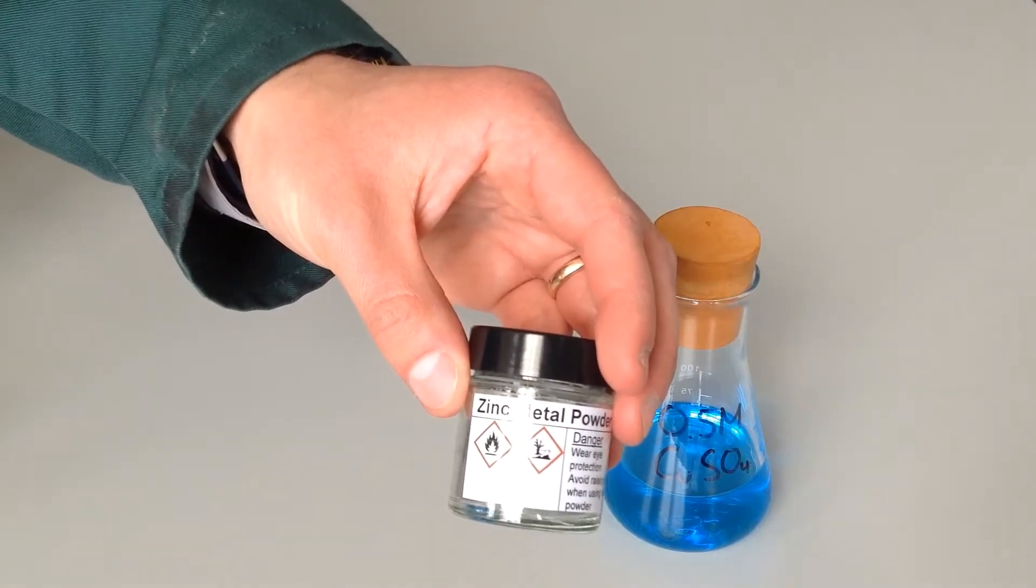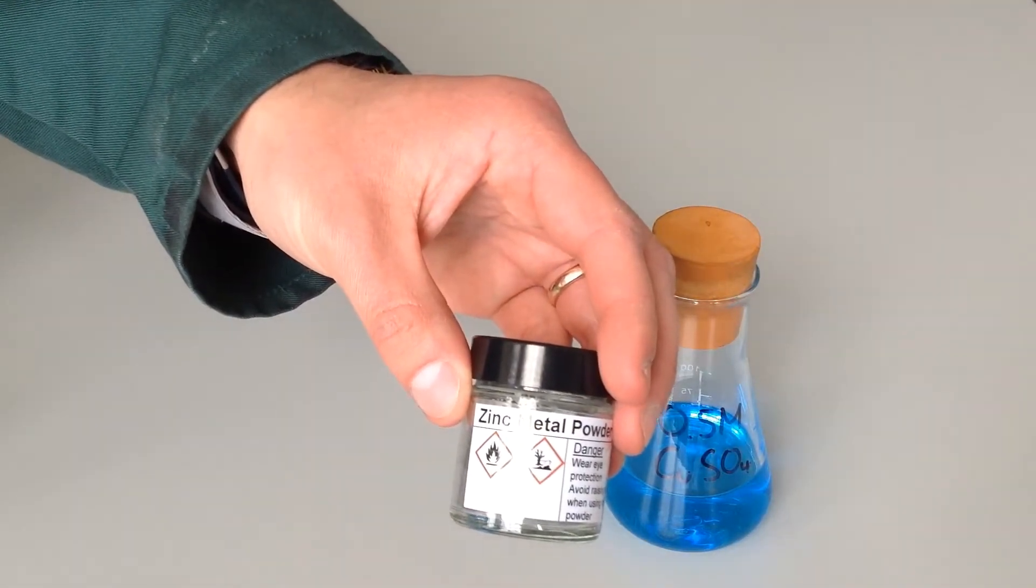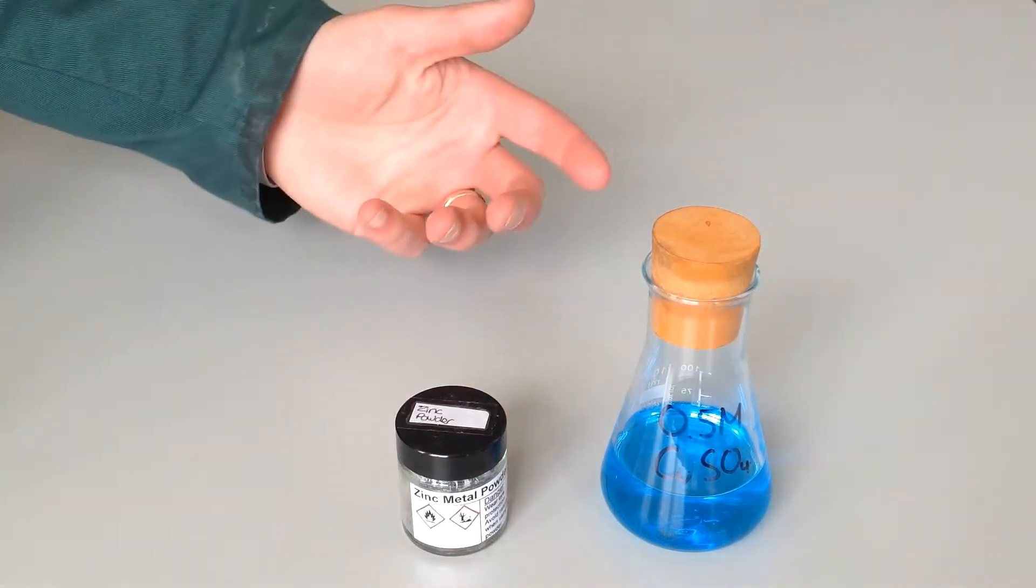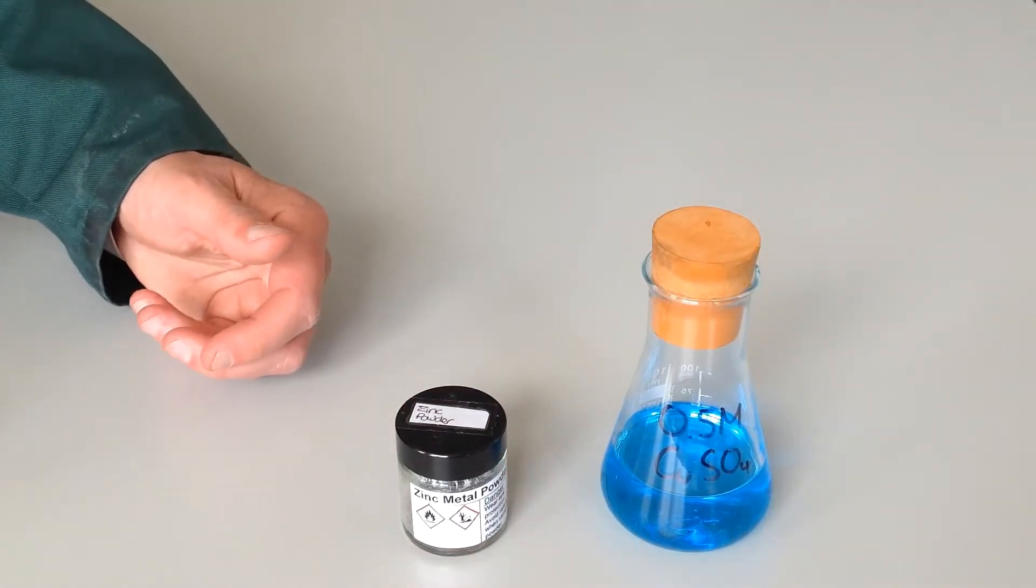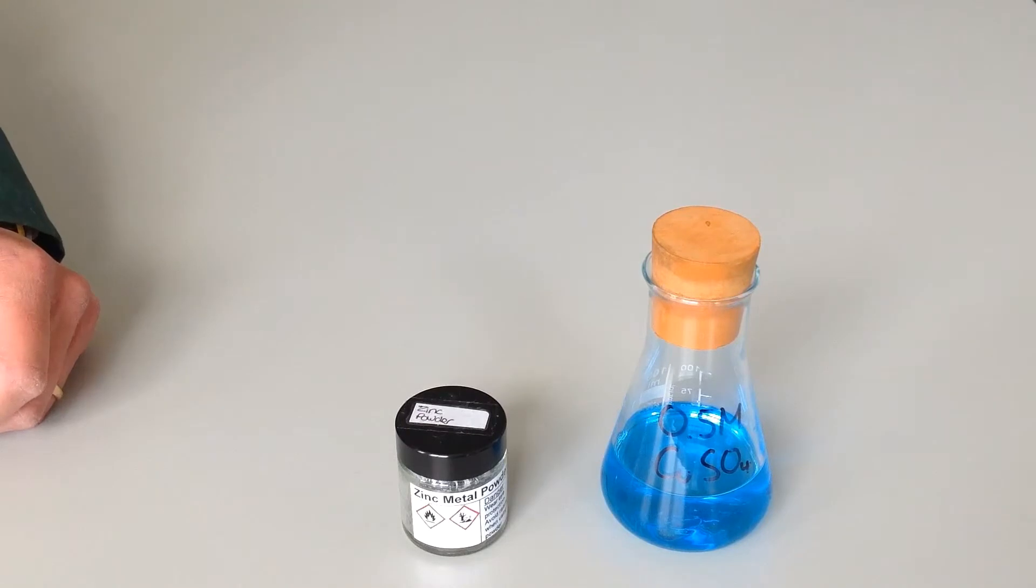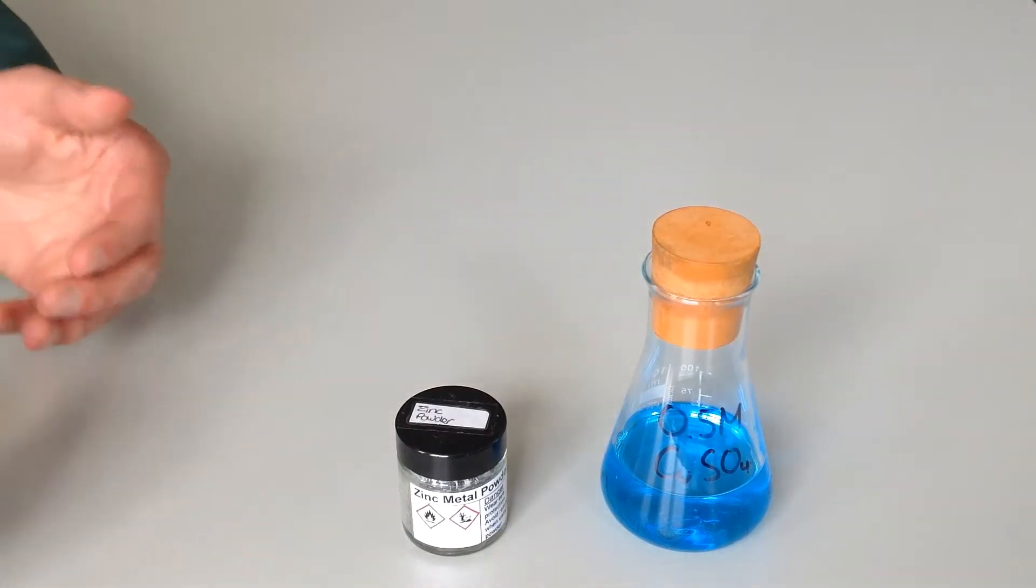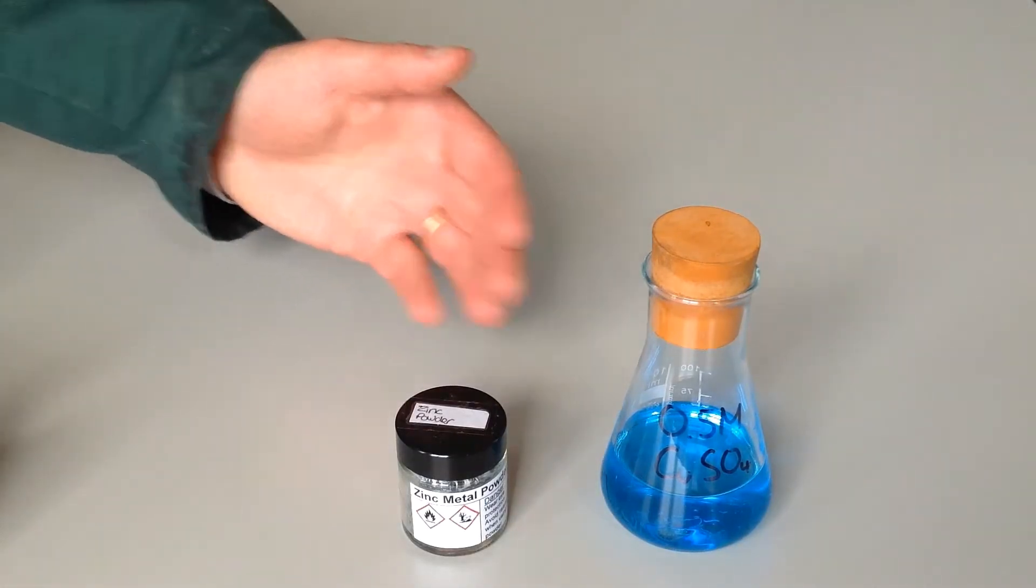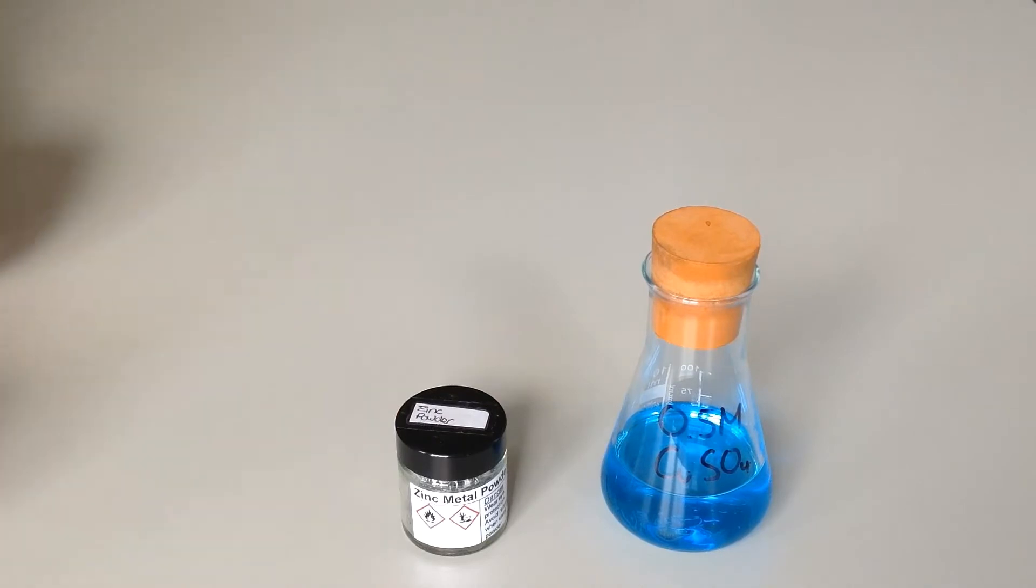It's also an environmental hazard, so we need to make sure that we dispose of our waste correctly. The copper sulfate solution is actually corrosive at this concentration, so again, some safety is needed there. Furthermore, we want to be able to do this fairly quickly so that we can investigate the effect of the concentration of copper sulfate or the mass of zinc powder or some other factor on the temperature change. So let's see how we'll do it.